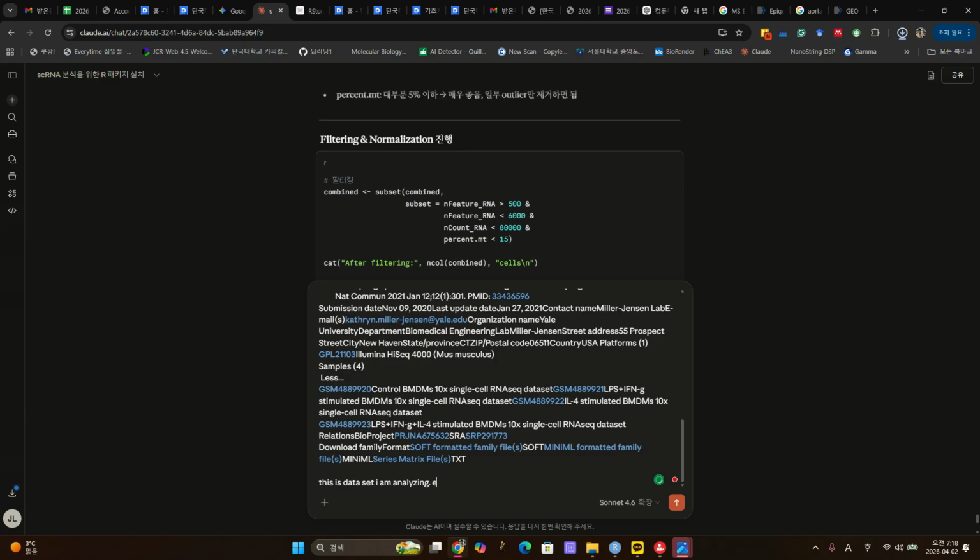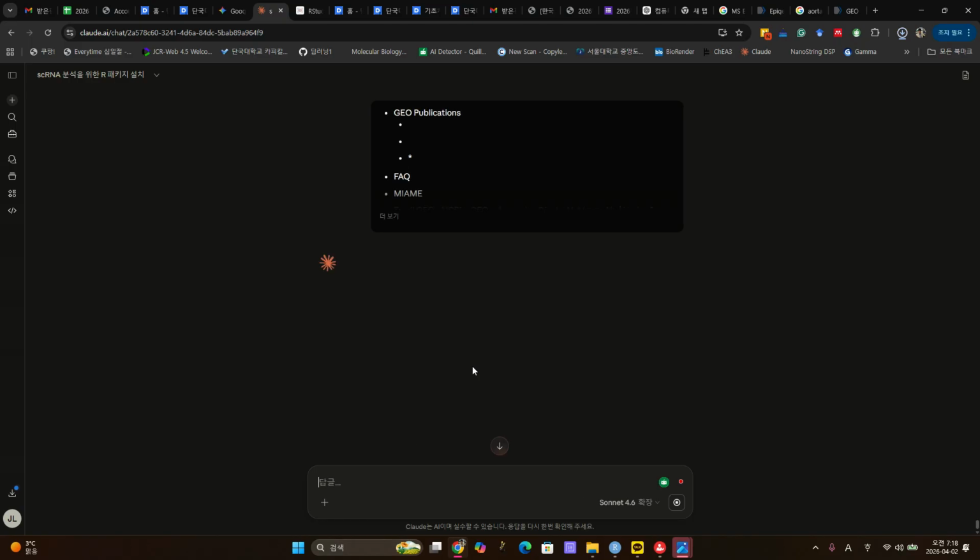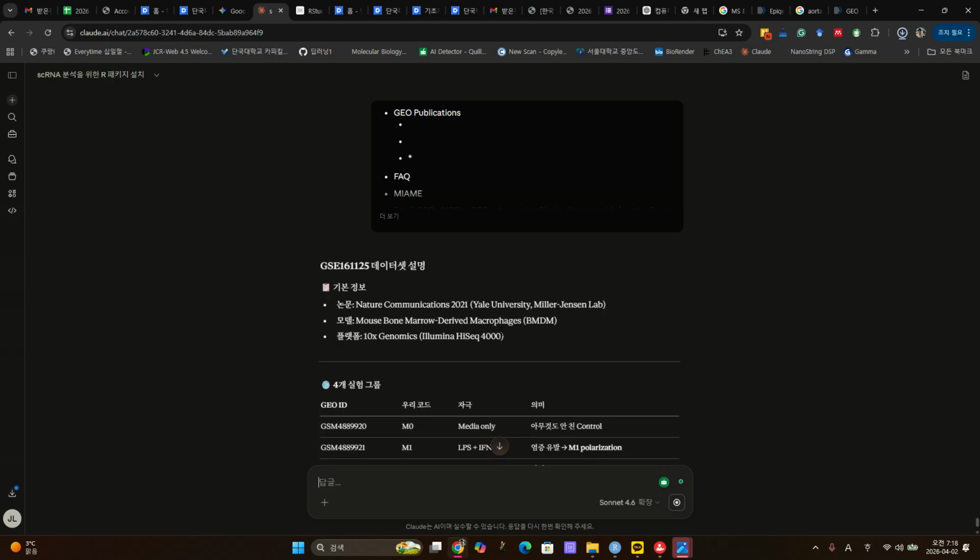Explain to me, what's this? So now you are educating your AI. So this is a data set we are analyzing. Maybe you can read all the things and catch the idea, but I want to simply get it.